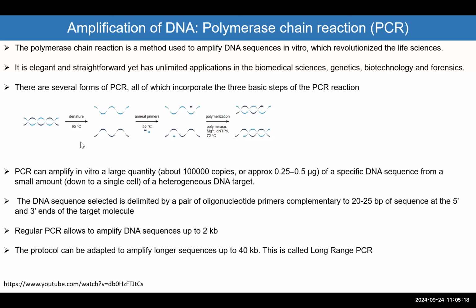degrees. Because in the cells, when the cell duplicates the DNA, it has the enzymes to do that. We don't have to use enzymes in vitro. All we need to do is simply unwind it by heating up the DNA to 95 degrees. And at 95 degrees, you will break the hydrogen bonds between the nitrogenous bases. Now, if you decrease the temperature from 95 back to 55, the DNA binding and re-annealing take place. But we can play with this by using primers.